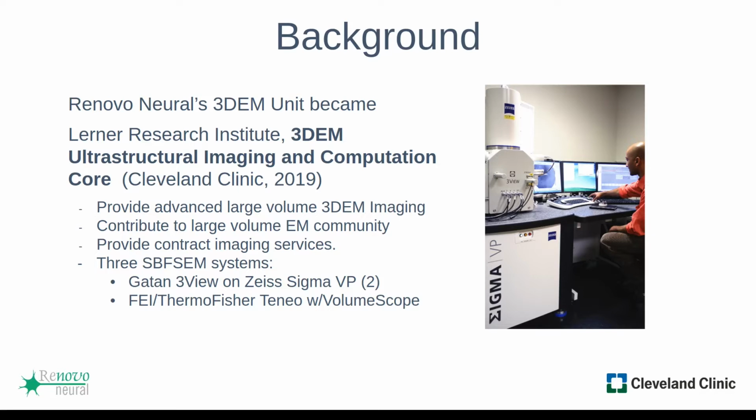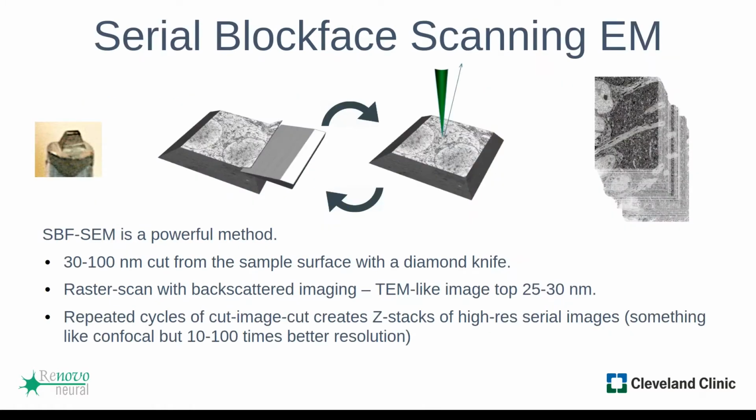We currently have 3 serial block-face systems. 2 are Gatan 3View systems on Zeiss Sigmas, and we have 1 Thermo Fisher Scientific Teneo with a VolumeScope. So before I go further into what we're going to talk about today, I just want to give a quick explanation for anyone here who maybe hasn't worked with a serial block-face SEM system.